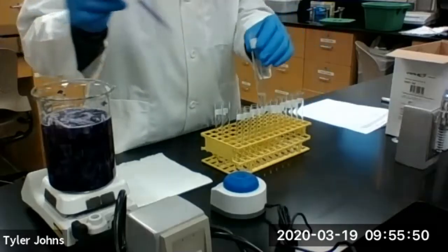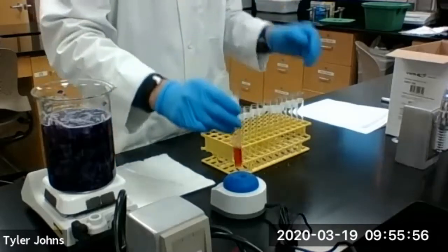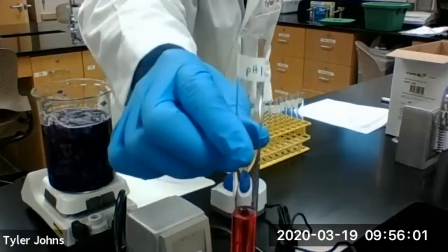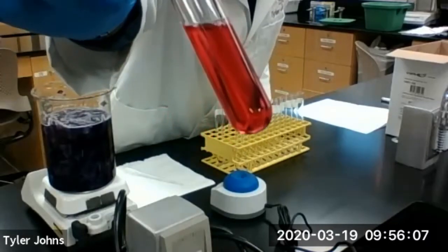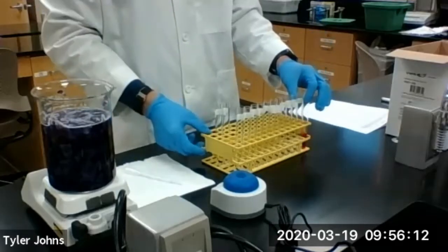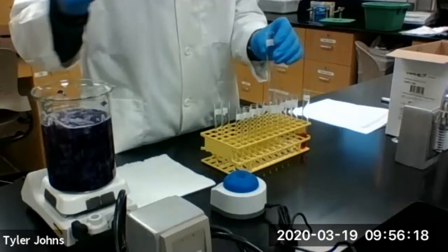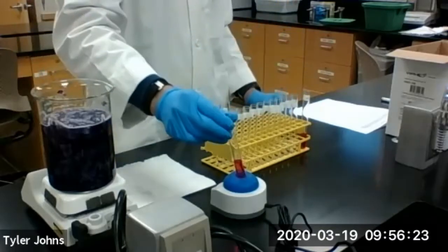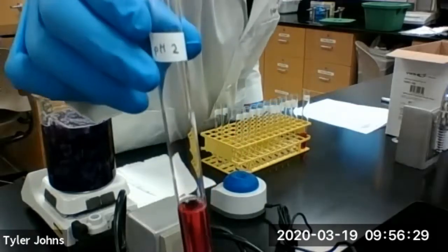I'm going to add 2 milliliters of cabbage juice to pH 1. Here's our pH 1 and the color. Next is pH 2.